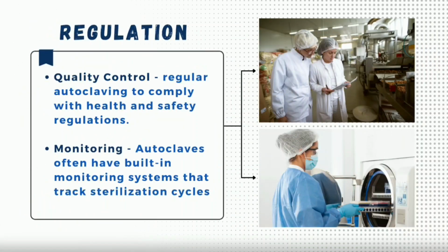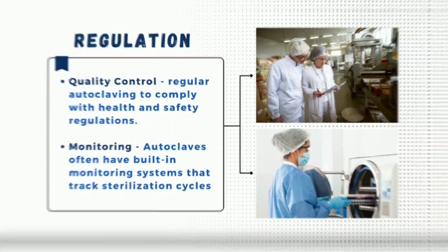It is also used for regulation. It is a critical process for ensuring safety, quality, and compliance in various industries. By understanding the regulatory requirements, implementing proper quality control measures, and monitoring the performance of the autoclave, organizations can ensure the effectiveness of this sterilization method.